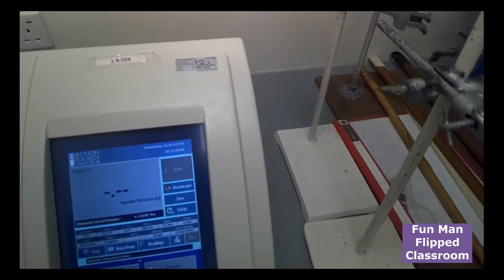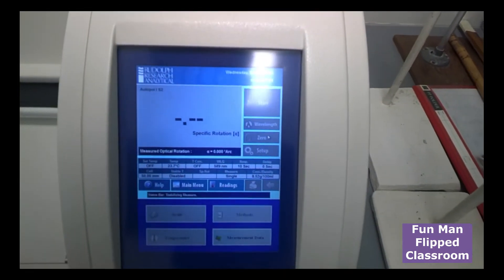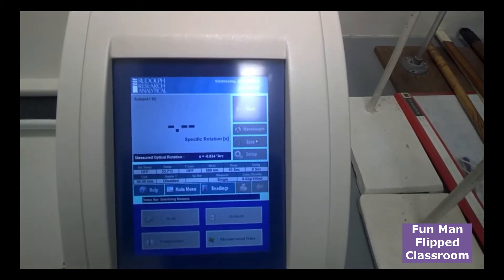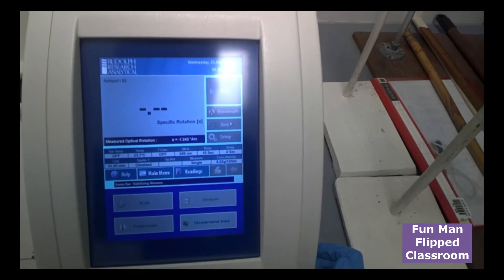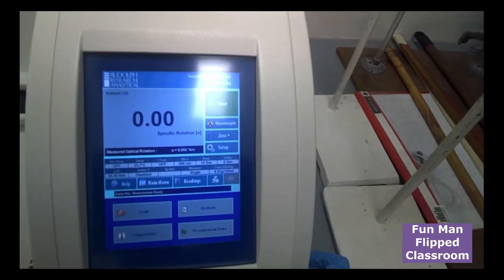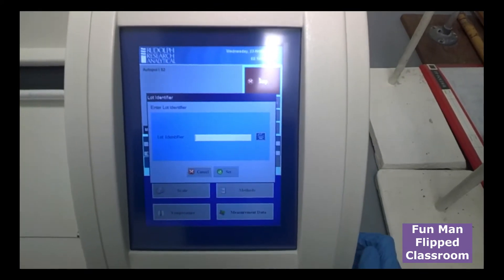So right now we can do a scan first. Place it into sample holder. Close. So of course, we have to do zeroing. Remember? Since it's all ethanol, and ethanol does not have any chiral center, we should expect the reading to be zero. So let's see what happens. Start.